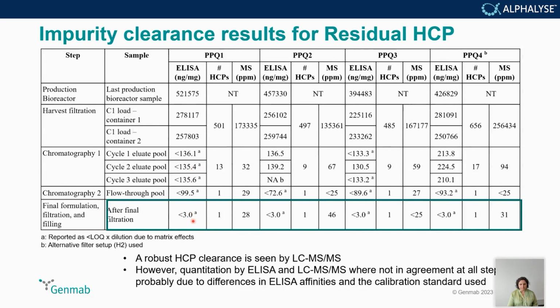Another thing we can take from here is that with LCMS, you have a quantitative result, but it's limited by the method.